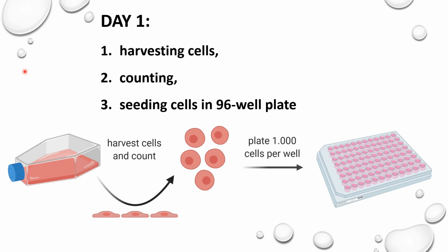In order to remove medium that both contains a lot of protein but also contains some specific inhibitors of the trypsin that we're going to use to detach the cells, which are the epithelial cells I talked about in the introduction, that are very strongly attached to the flask. And we need to get these cells into a suspension in order to go into the 96-well plate.